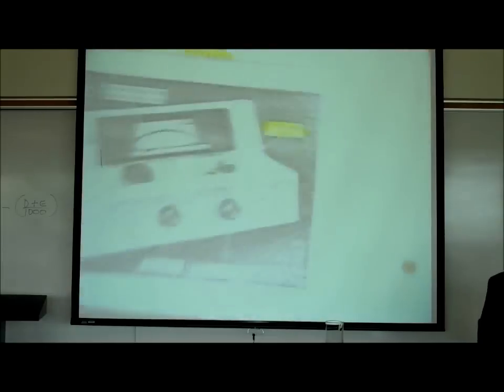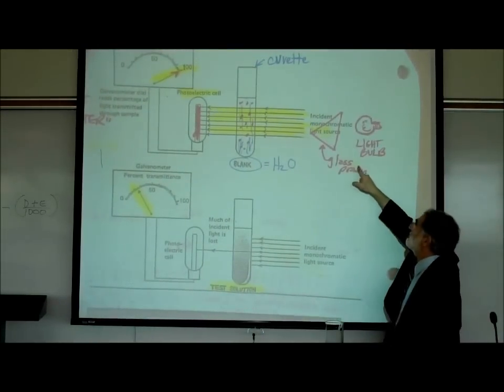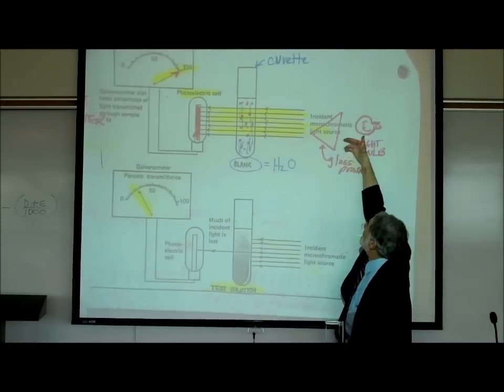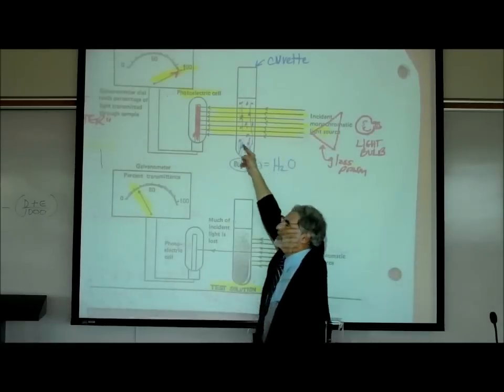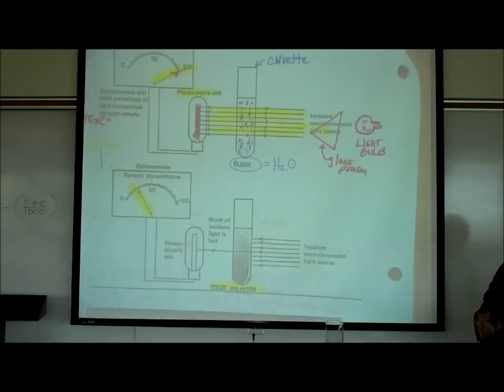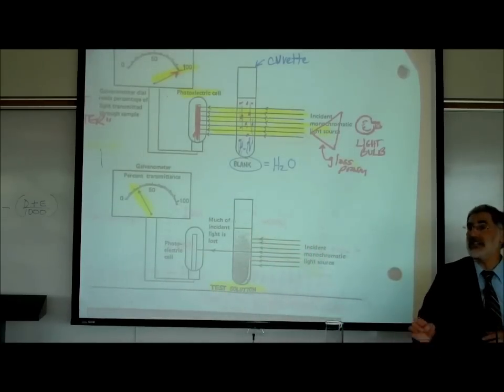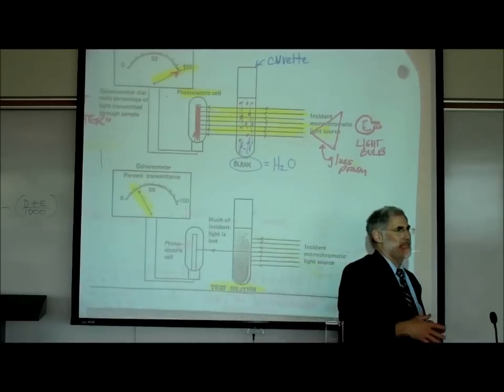So, on page 2, the way I represented this right here is here's our light bulb. It's giving off white light. We insert a prism, and we can aim just blue light or green light or orange light through this solution. Now, in fact, they really don't use a glass prism. They use a device that you might have learned about in a chemistry or physics course that's known as a diffraction grating. But the way that a diffraction grating works is essentially the same as a prism.